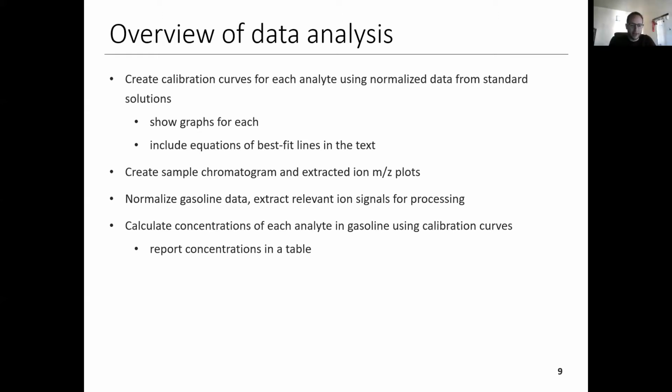So I guess I'll ask a question. By a show of thumbs up in the Zoom, how many of you have been able to normalize all of the standard data and then get the calibration curves for the different analytes? Could you actually go over how to normalize the data again?